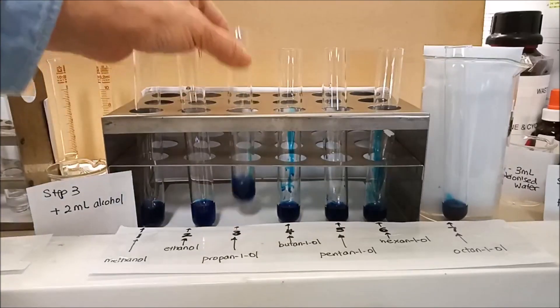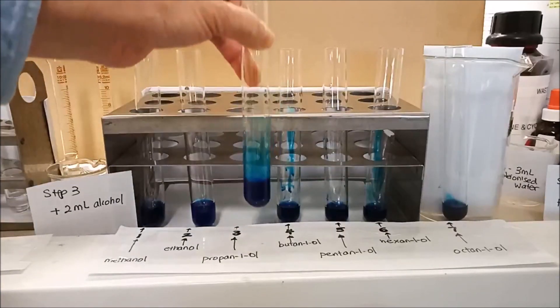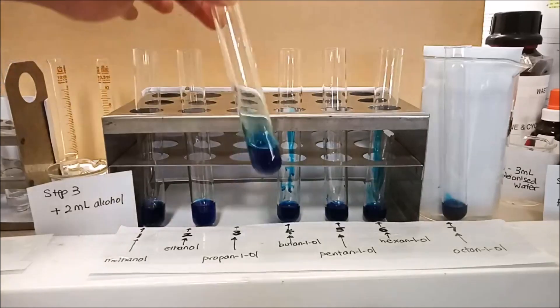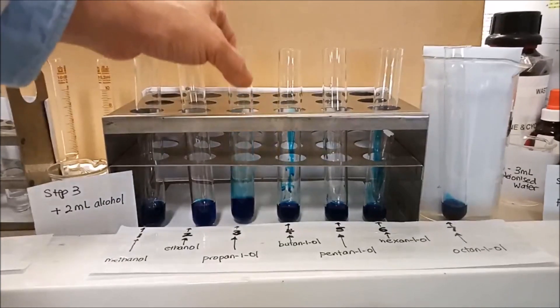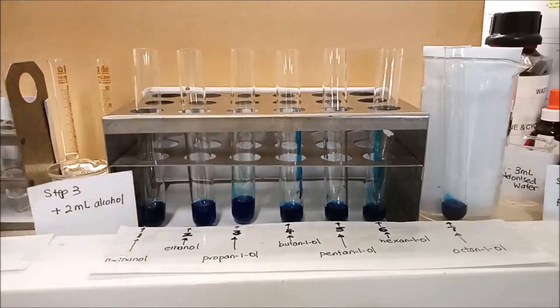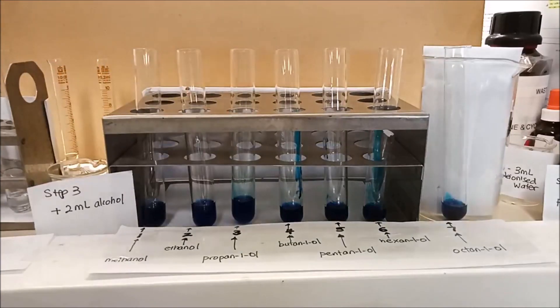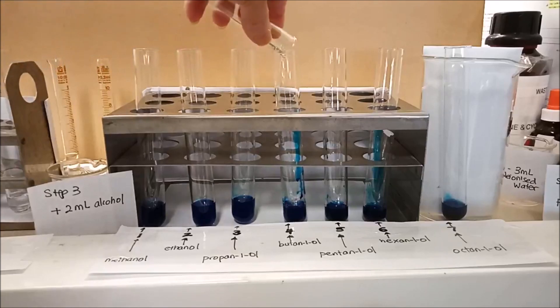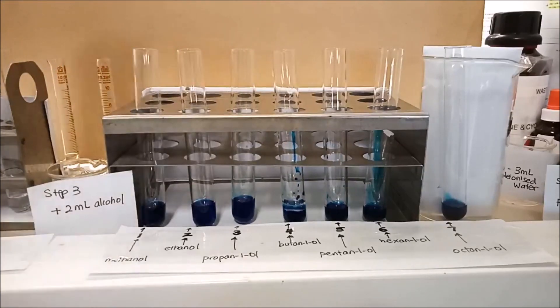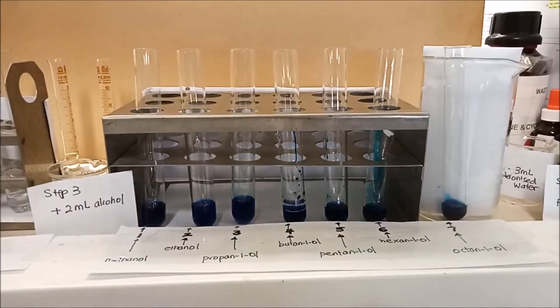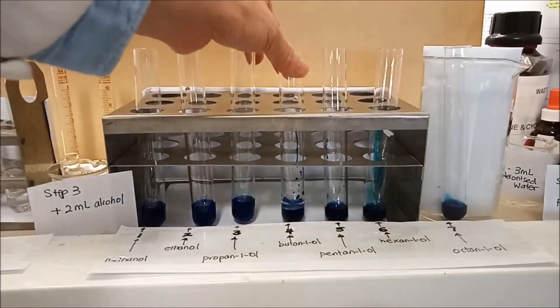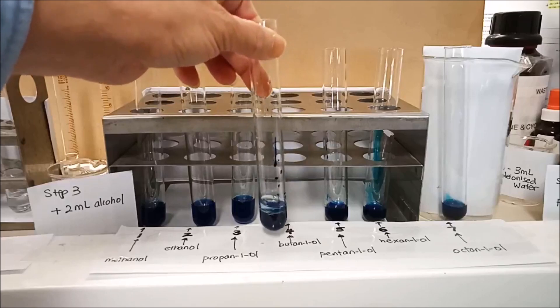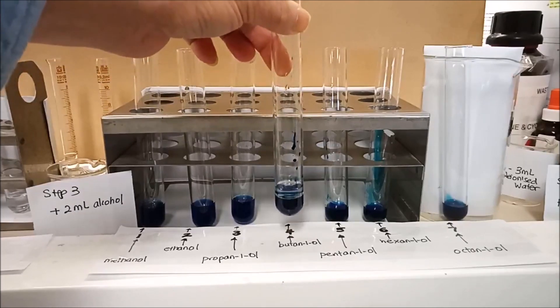So we have three mils of butanol. So we have three mils of water with two mils of butanol. Butanol is less... And let's see what happens here. You can see what happens here. You can see very clearly there are two different layers there.